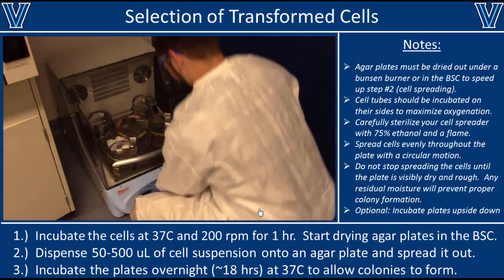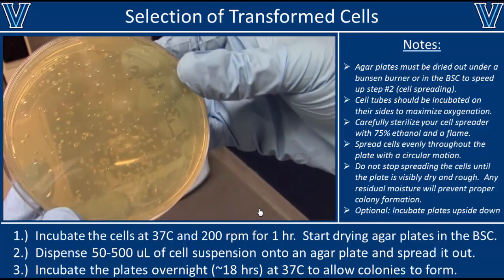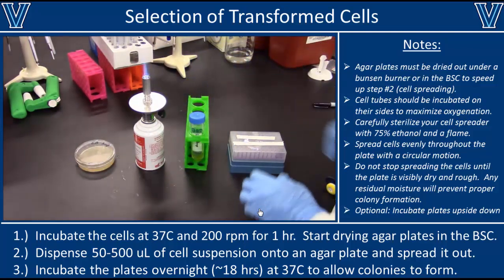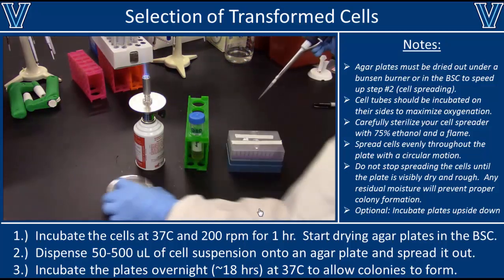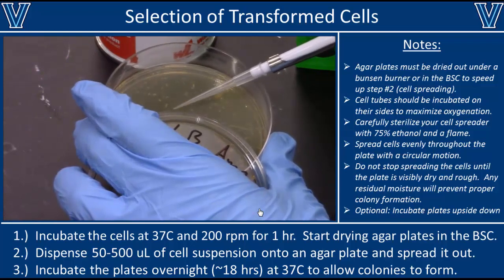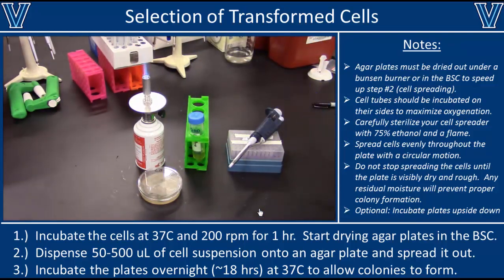The next morning, hopefully your plate will show several isolated small brown dots — each is a bacterial colony that contains your plasmid. You can then use these colonies to start a small liquid culture for a plasmid prep. Take a sterile pipette tip and carefully scrape off one colony — only one. Eject the tip directly into some sterile media and incubate overnight at 37 degrees Celsius with 200 rpm of shaking. You can then use this culture to prepare DNA for sequencing or for transformation into BL21 E. coli for protein expression. Always keep the plates in case the colony picked contains a mutated or aberrant form of the plasmid.